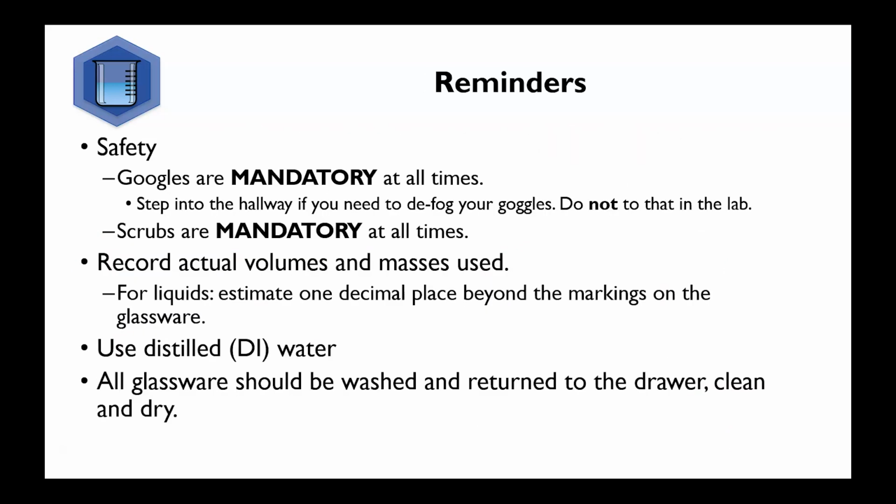This is the first lab experiment where we'll be working with hazardous chemicals that could cause you physical harm, so we expect that you'll follow laboratory safety rules. If the hydrochloric acid comes in contact with your skin, it will cause burns, so you're expected to wear your scrubs, goggles, and gloves at all times. If your goggles fog up, please step out into the hallway and wipe them off. Do not take your goggles off in the lab room.